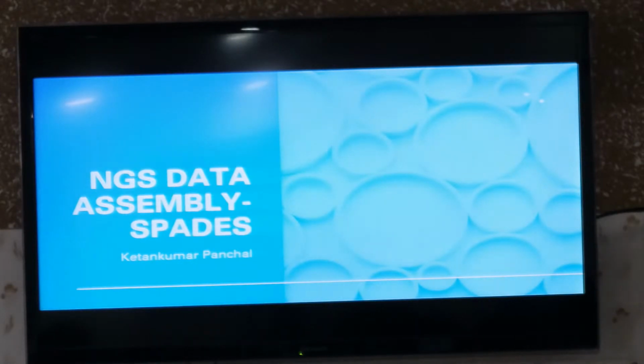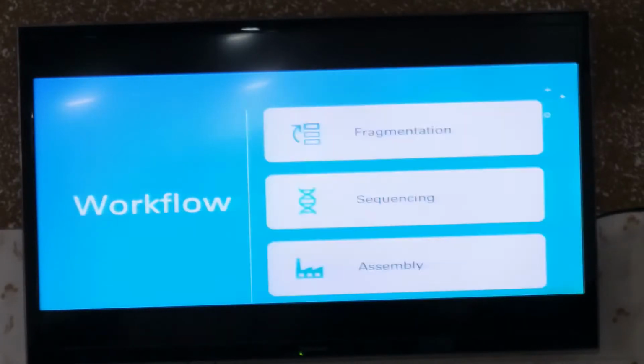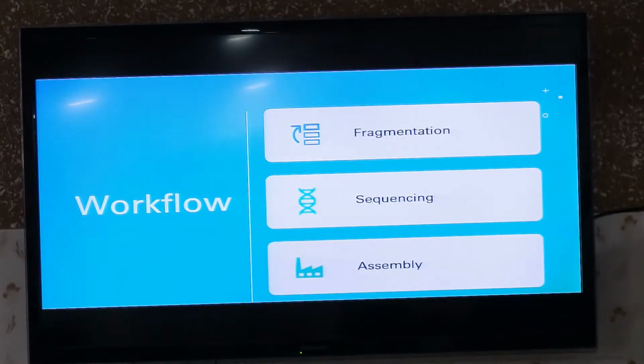So those researchers who are dealing with the genomes are mainly interested in such kind of analysis. In that, what we are doing is that if you are interested in sequencing the whole genome of a microbe, you will isolate the genomic DNA, you will sequence it, and you will try to reassemble all the reads which you have been given from the instrument. The approaches for assembly differ from the user perspective.